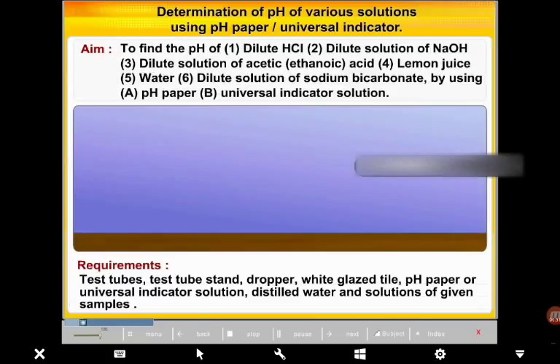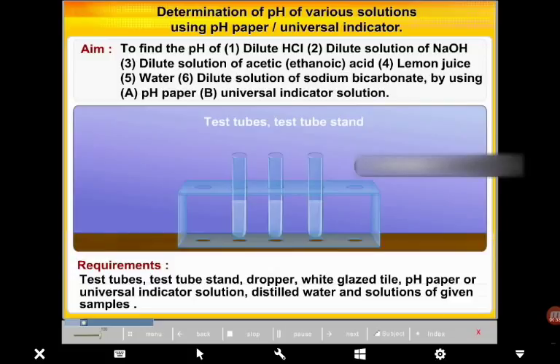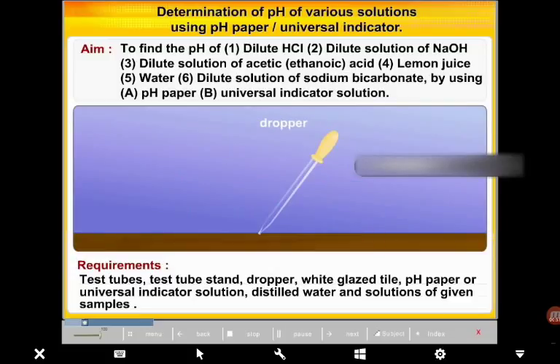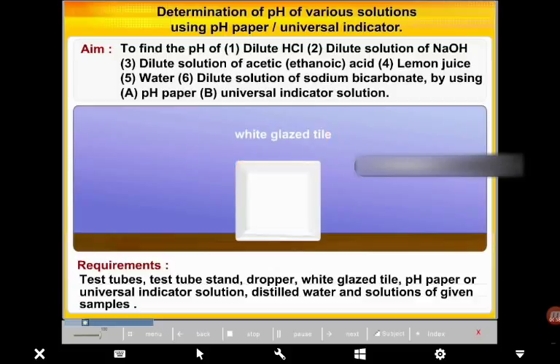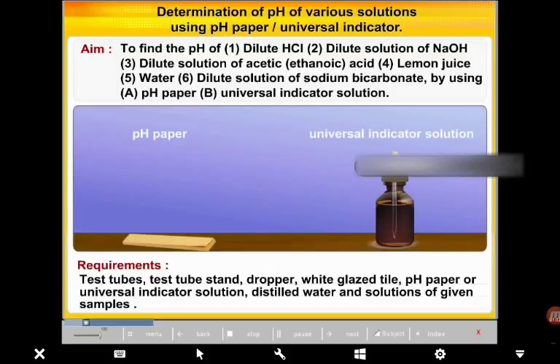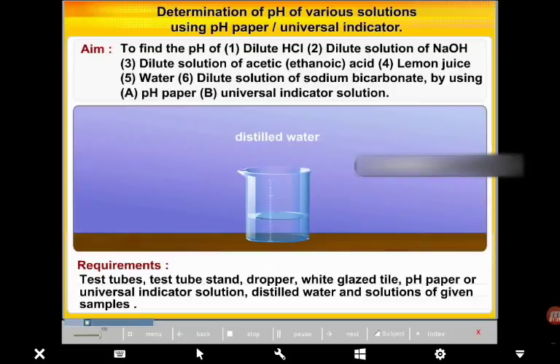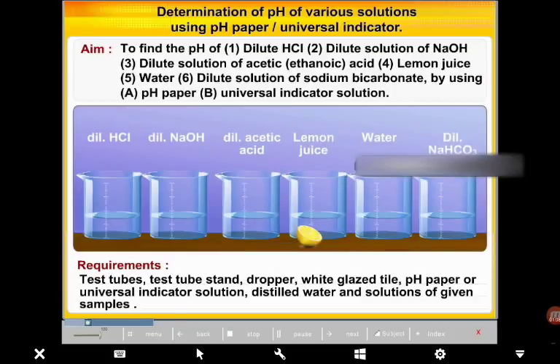Requirements: test tubes, test tube stand, dropper, white glazed tile, pH paper or Universal Indicator Solution, distilled water, and solutions of the given samples.